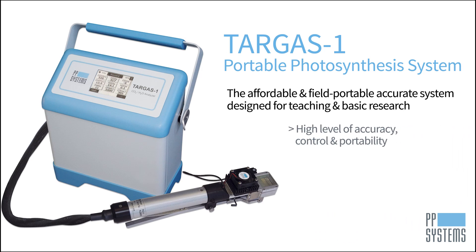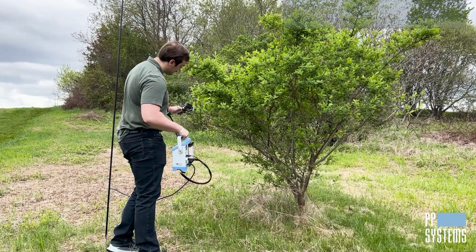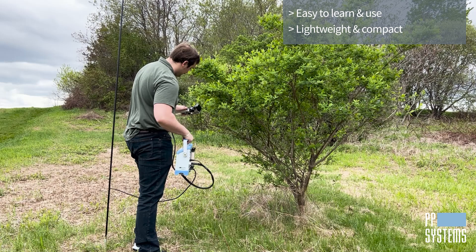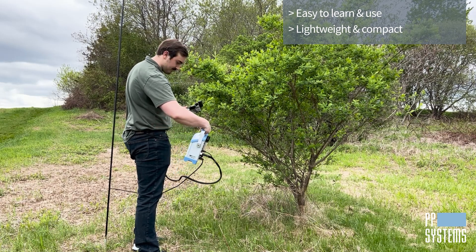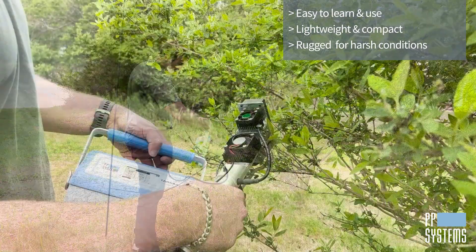The Targus One portable photosynthesis system provides high accuracy, control, and portability with minimal maintenance, and it's extremely easy to learn and use. The lightweight console's durable aluminum enclosure and shock-absorbing polyurethane base provide robust reliability in harsh environmental conditions.